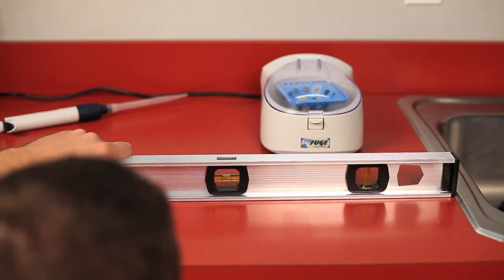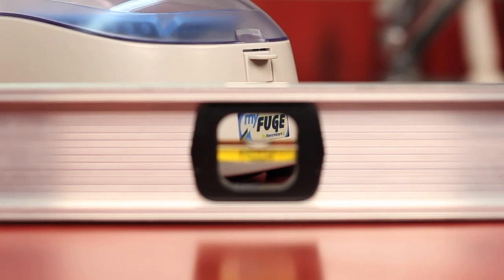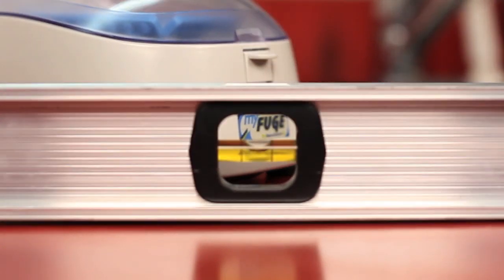Step 1. Check to make sure the centrifuge is on a flat, level surface. Otherwise, this can throw off the balance as well.